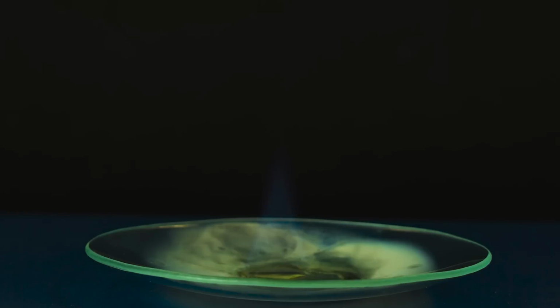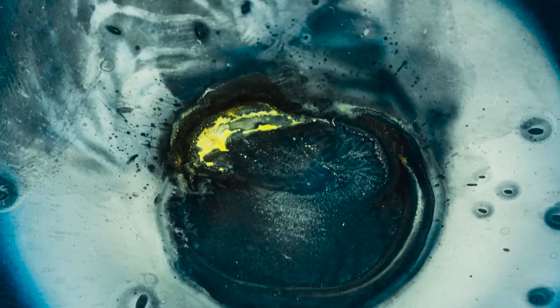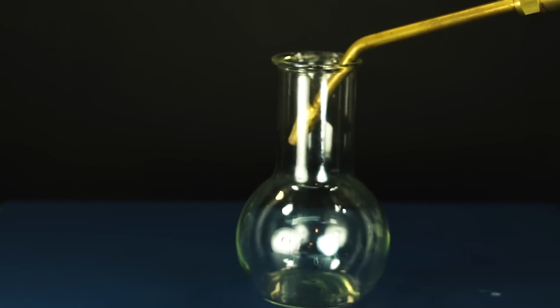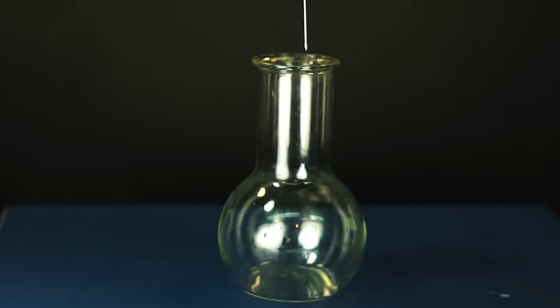You can see elemental sulfur formed by partial oxidation of carbon disulfide by the oxygen contained in the air. Carbon disulfide has the widest range of explosion limits. Even 1% of carbon disulfide in a mixture of carbon disulfide and air is enough to make them explode.